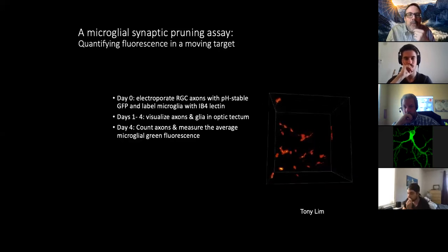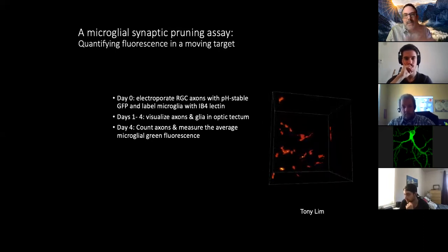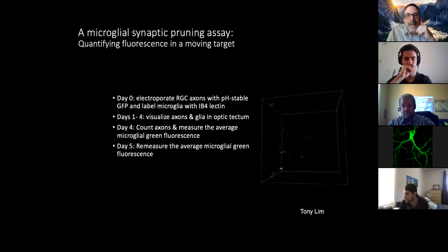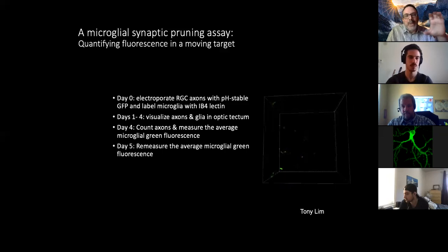And then on day four, he counts the amount of green fluorescence associated with the microglia. So the way he does that is he creates a mask from the microglia and just asks how much green fluorescence is associated with that masked microglial territory. And then he does the same thing the next day on day five. And so that question then is, between day four and day five, on average, how much did microglial green fluorescence increase?